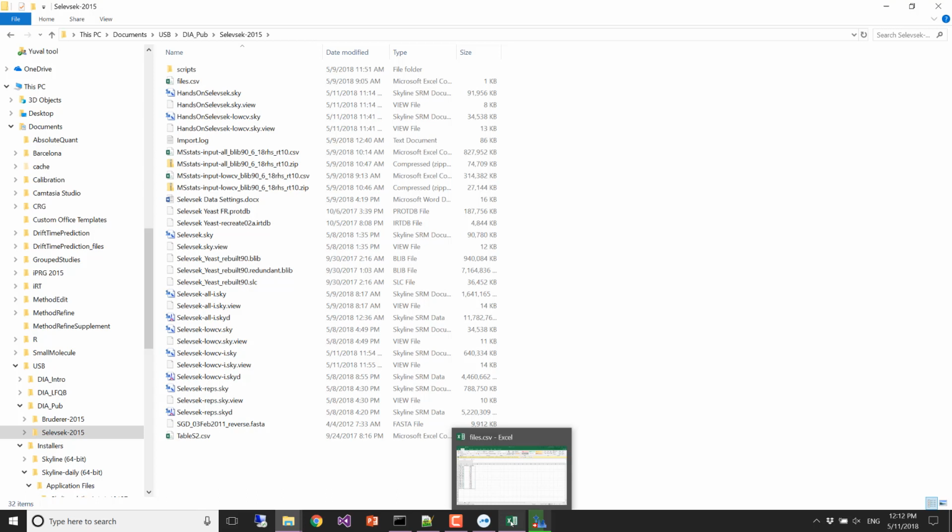In our replicate measurements, we'd love to see a CV of 0, meaning we measured exactly the same thing in all 8 replicates. But what we're doing is saying that above some point, we're just not going to include peptides in our quantitative measurements if we can't prove that we can measure them reproducibly.